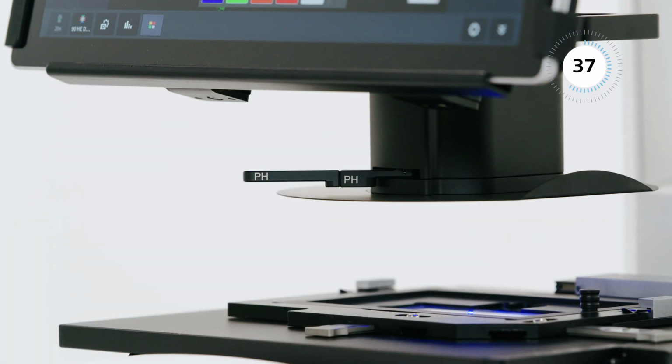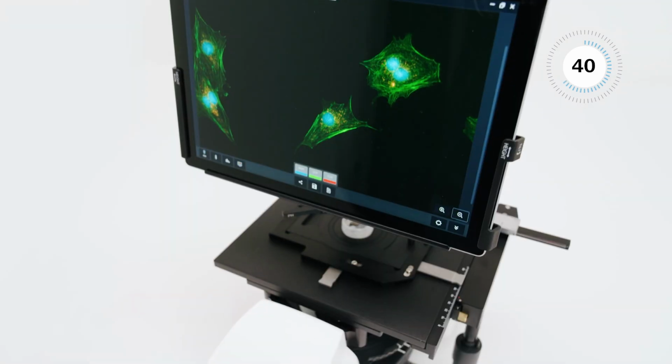The small footprint and the light shield guarantee an optimal fit for your lab bench, flowbox, or wet lab with ambient light.